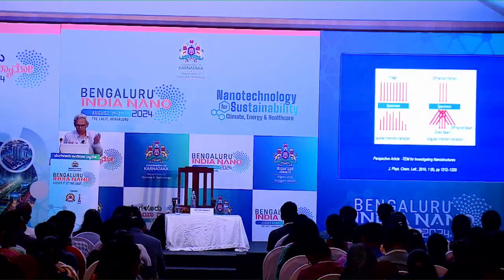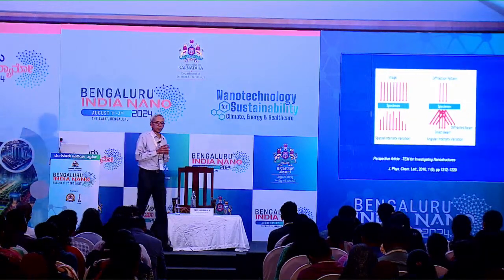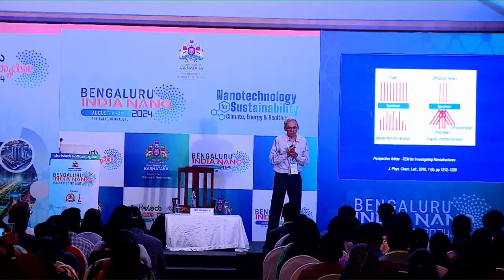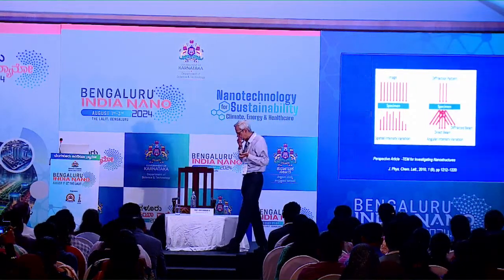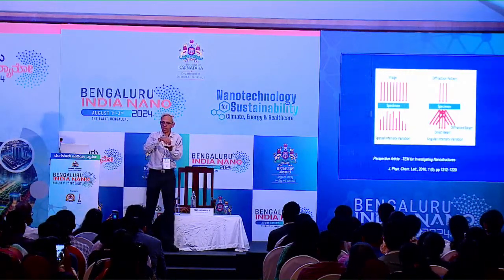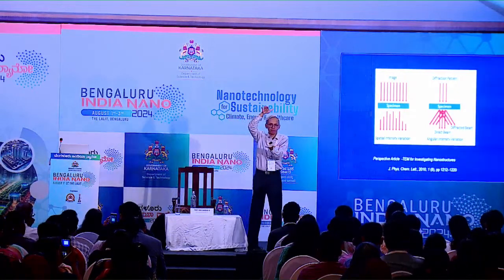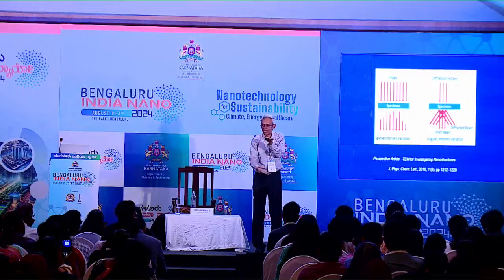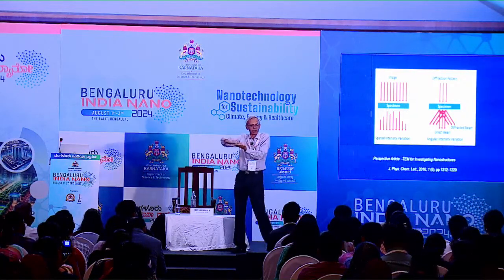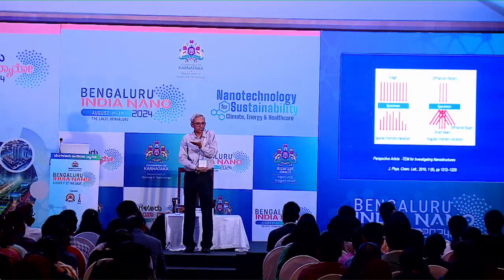Okay, so let me briefly tell you about the TEM in 2 minutes, about imaging and diffraction patterns. For that, I'll take a simple analogy so that it actually makes sense. Suppose I have a glass sheet and I have painted some regions black, and I have a parallel beam of light falling on it, and I have a screen or detector below. Suppose initially it's a plain glass. What intensity will I see on the screen? Uniform intensity, there's no change at all.